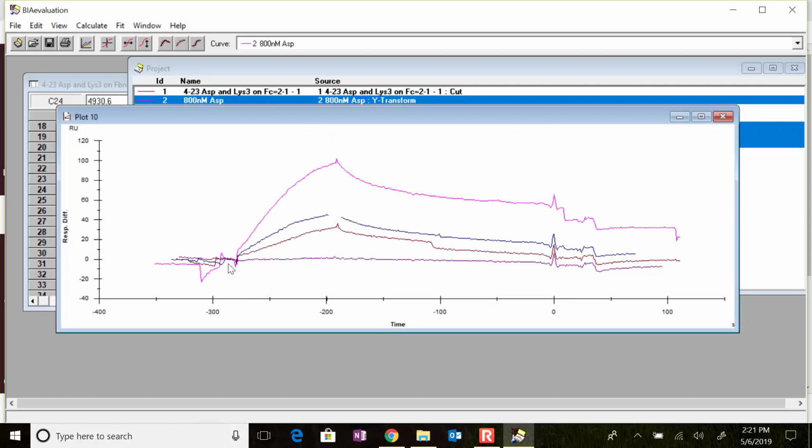And see, that's exactly what it just did. And now I have what looks like a pretty good lineup. You know, if I have more time, I might want to do another X transform. You can keep doing those X transforms until you have it lined up perfectly. Or you can try something. If your fit is doing something weird to you and you want to try another X transform and refit, often that has helped the fit work better for me.